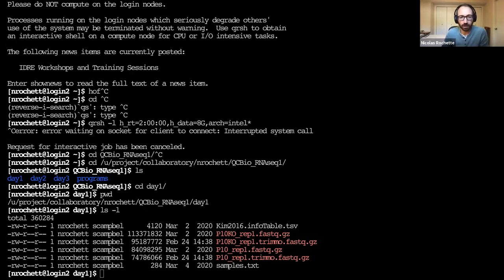Okay, so this is on the cluster, and if you need the trim file, the clean reads file, it's in this directory here, which is the directory you originally copied, and it's still in the same state as what you originally copied. In addition, if you cd to this directory, you're going to see this trim and clean reads file, which you can use for exercise 4.